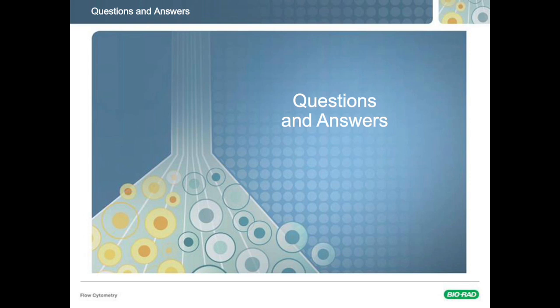Okay, great. And I guess also another leading question would be, if you're having trouble creating the nice side streams, would you then be adjusting the charge phase or deflection or both?